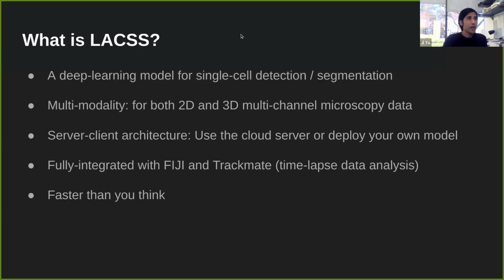Welcome. My name is G, and today Nick and I would like to do a very short demo session to show you the work pipeline for processing 5D microscopy data in Fiji. This relies on software we developed called TrackMate-Lacss. So I'll briefly go over it.